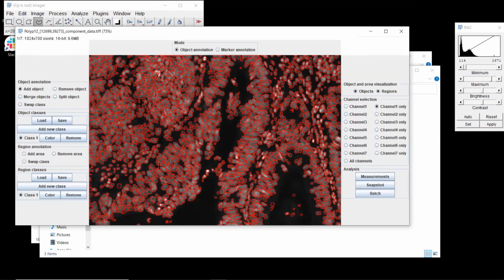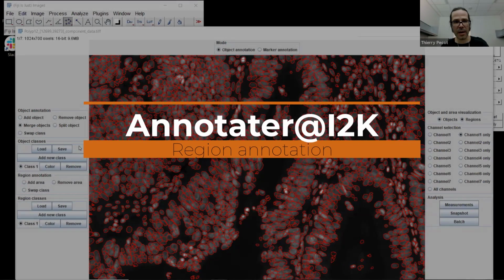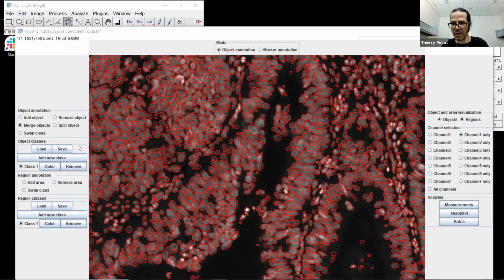Obviously, you're not going to spend a lot of time. Your goal here is not to segment my image. So let's just play with it a little bit, and then we'll look at the regions. All right. So if there's no other question, we're going to switch to the region annotation now. So let me just do that. Okay.